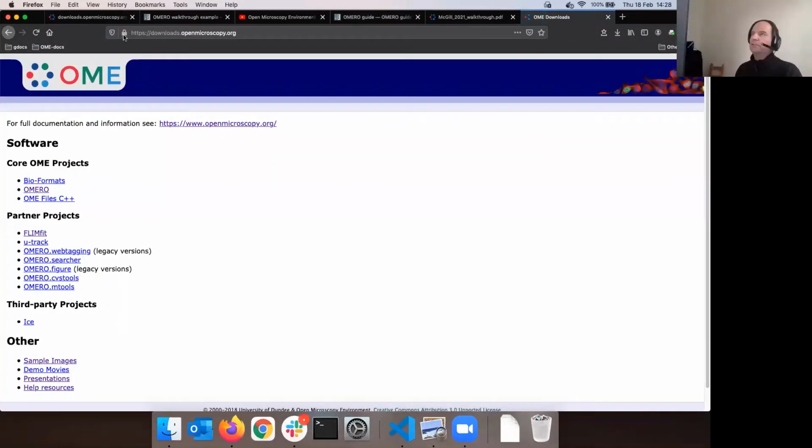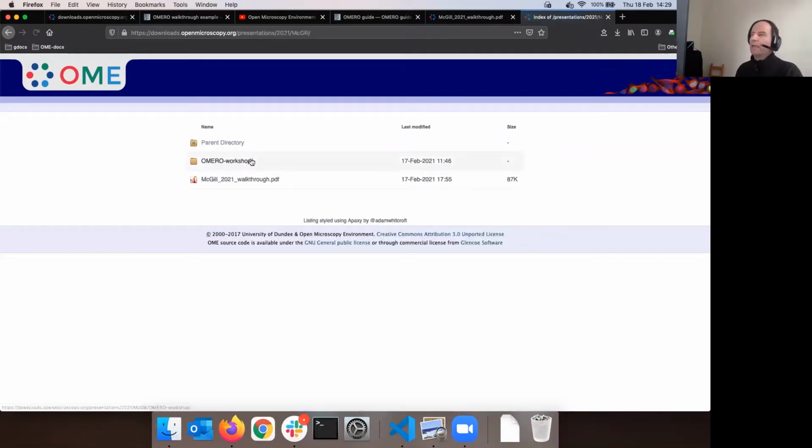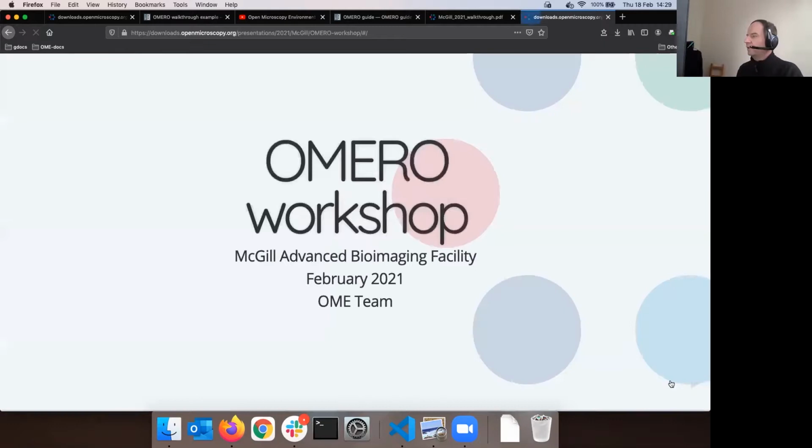So either you do the long way as I do, but you can see that I'm clicking myself through 2021 and McGill. Now 2021 is obvious. This is this year. McGill is obvious as well. Under this folder, there is the presentation. Okay, so let me click on that folder. Now you try, that's the presentation I showed you. So if you go through that by clicking on this right button, you will have the presentation in your hand immediately with no downloads on your part, okay? And you can click on the links there.